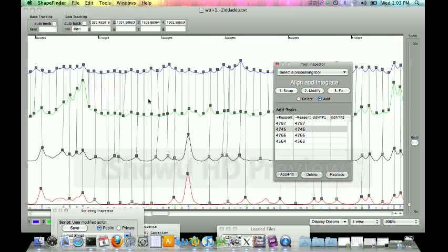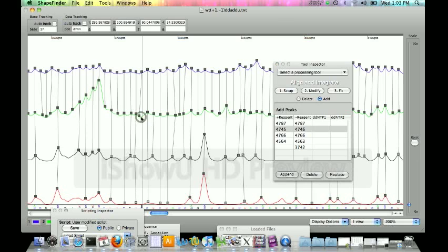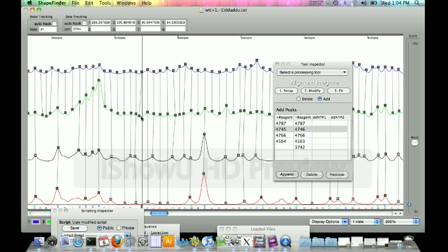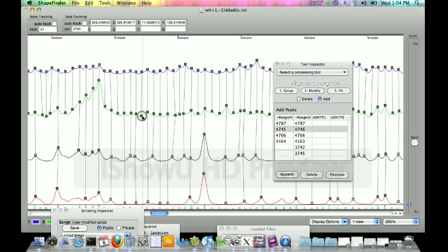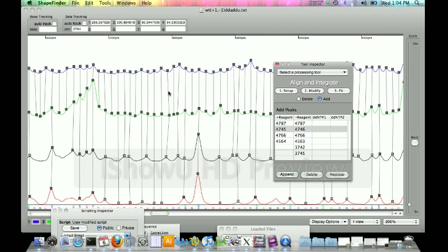We've got some angles going on to the background, so we're just going to go ahead and fix those. If you click on a spot in the background without actually clicking on a spot in the first filter, it will show you this little line here, and you can see where it really should line up. As soon as I click on this back filter, I'm going to click append here, and it straightens it out a little bit. You can keep doing this until you get it as straight as you like, but the program might not respond.